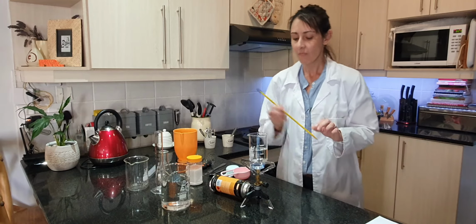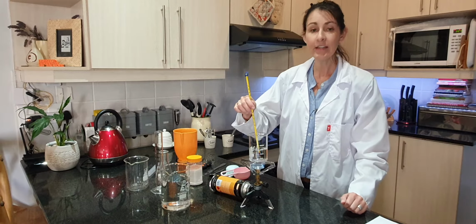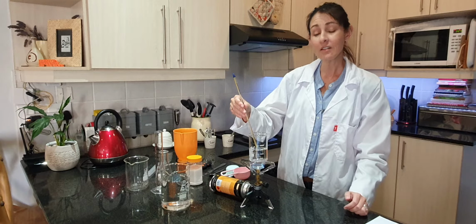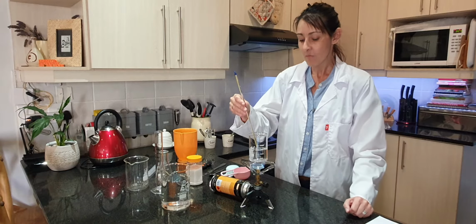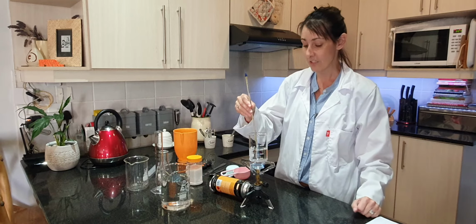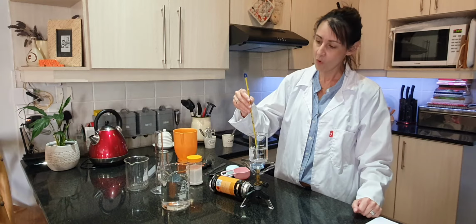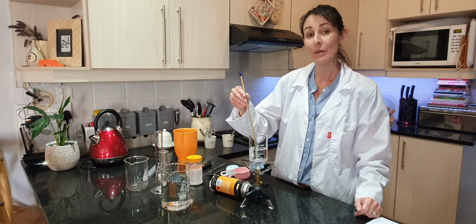I'm going to stir it a little bit so that the heat gets distributed evenly. I will also leave my thermometer inside the water, but not touching the bottom of the glass beaker, because otherwise it's going to take the temperature over there and not the temperature spread through the liquid. As I'm holding it like this, it's already 30 degrees now. Stir it a little bit more, and I will let you know once it starts to make bubbles.